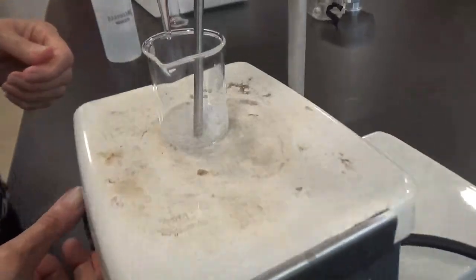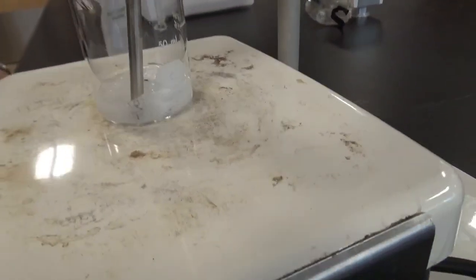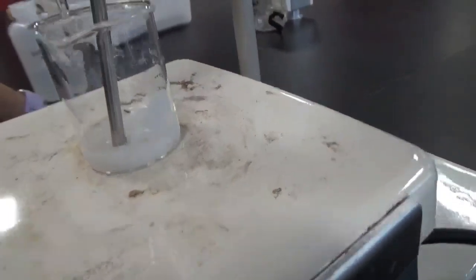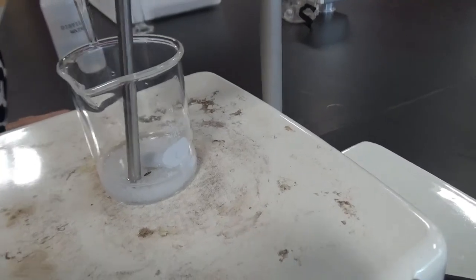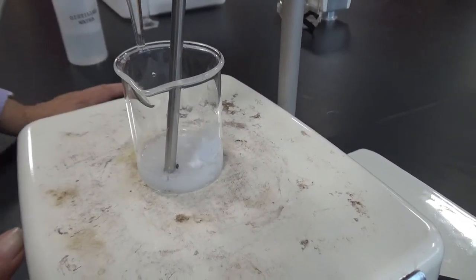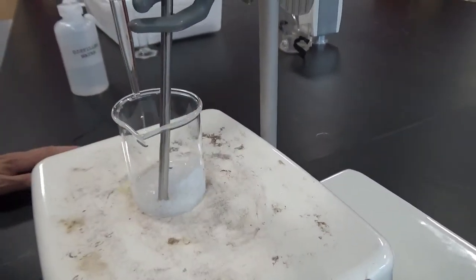19. All right, just turn it off. Well, luckily it's not a glass thermometer, so this probe is not going to break. Look, I have a piece of dirt in there. Yeah, that's not bad. I have to get that dirt out. I really don't like that. It's like a bug. Is that a bug? We'll just leave the bug. It's not going to affect the solubility. Leave the bug. Not going to cause any problems.